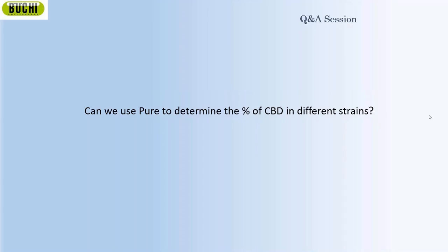Let's say you have big data for 15 to 25, and you can measure strain A and strain B from the same calibration. But if you are going for hemp or marijuana, then the results will be different, because in hemp you will have higher CBD, in marijuana you will have very low CBD. In this case, you have to create two different calibrations.